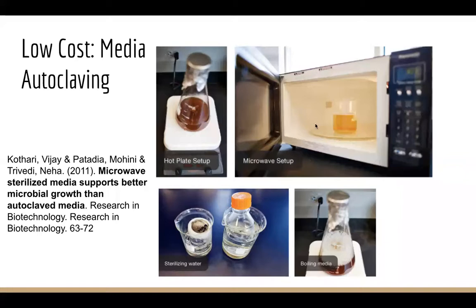And actually, all the time, because our autoclaves where I work are used quite often, I actually use a microwave, and there's a little protocol for using a microwave, which is much cheaper than an autoclave, for doing up to 500 mils at a time in two different Schott bottles of 500 mils in glass bottles. And it works really well. I do lots of big cultures that way, actually. Yeah, and you can use water as well, as long as it gets up to 115 degrees. And again, you just have to boil the media. This can work with liquid agar as well.